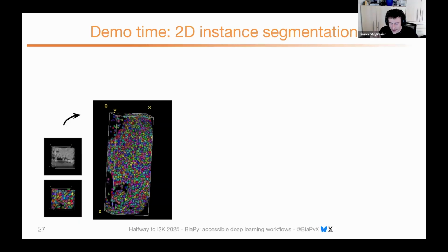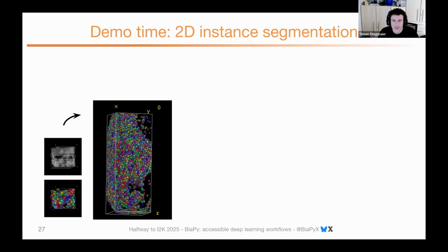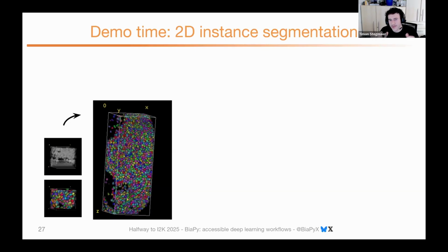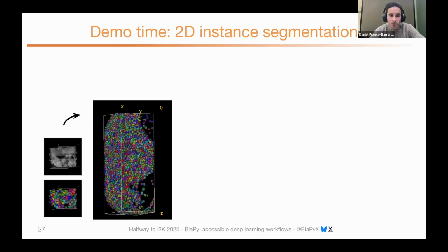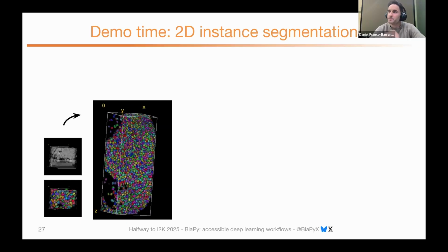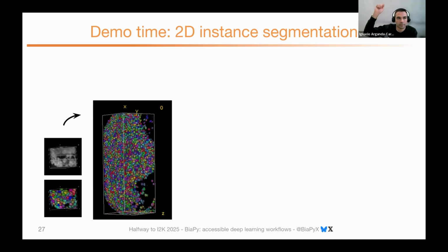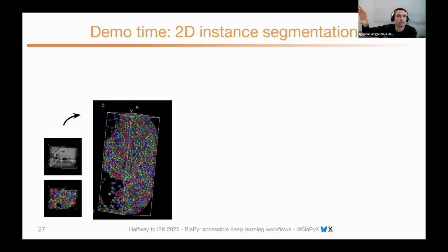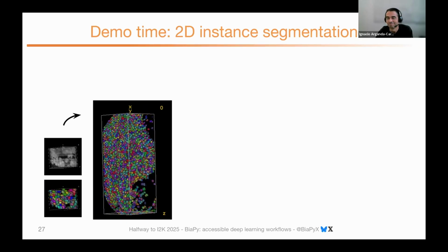I have a question about the detection of the centroid problem. Could you also combine this with a specification where you classify types of cells or something? Is that done already? So not only detecting the centers, but also classifying the cells that you're detecting. Yeah, so this is just an option in our workflows. You can have the coordinates of those objects and their categories, and we have workflows and models to do that. Very good question. Something else?